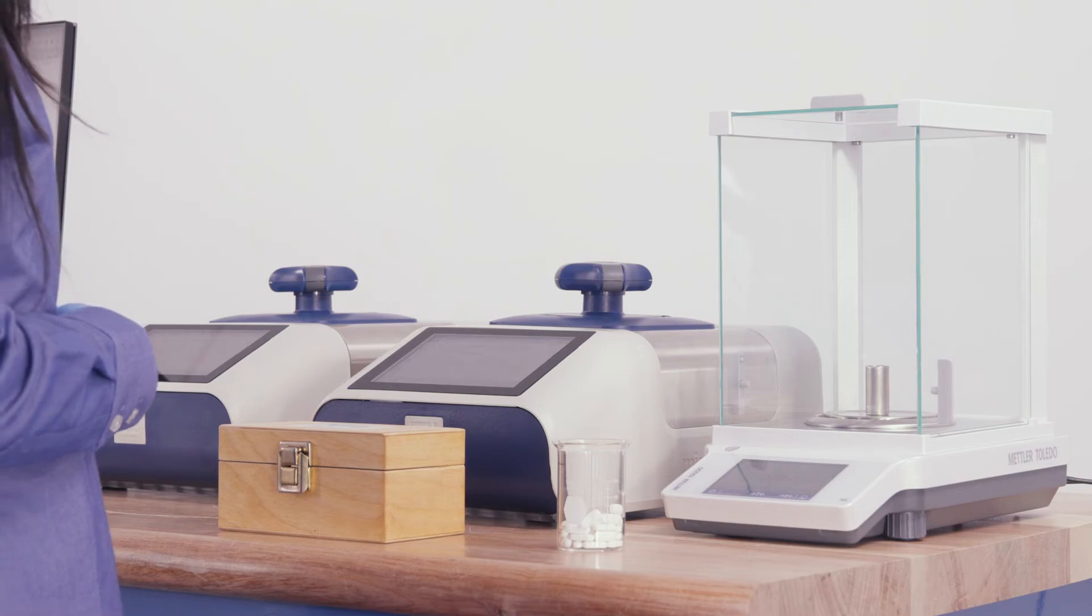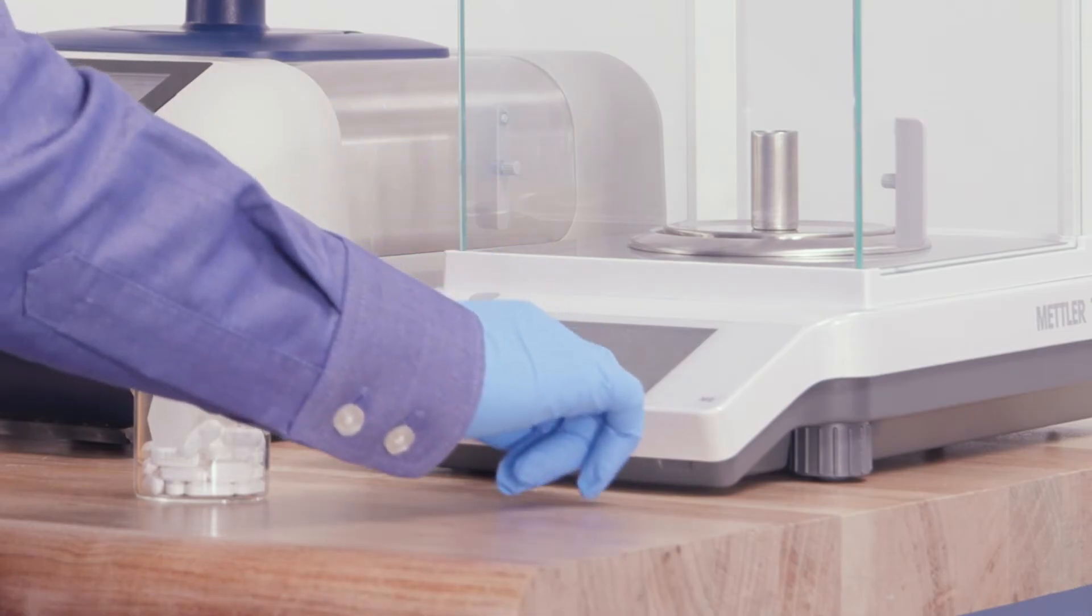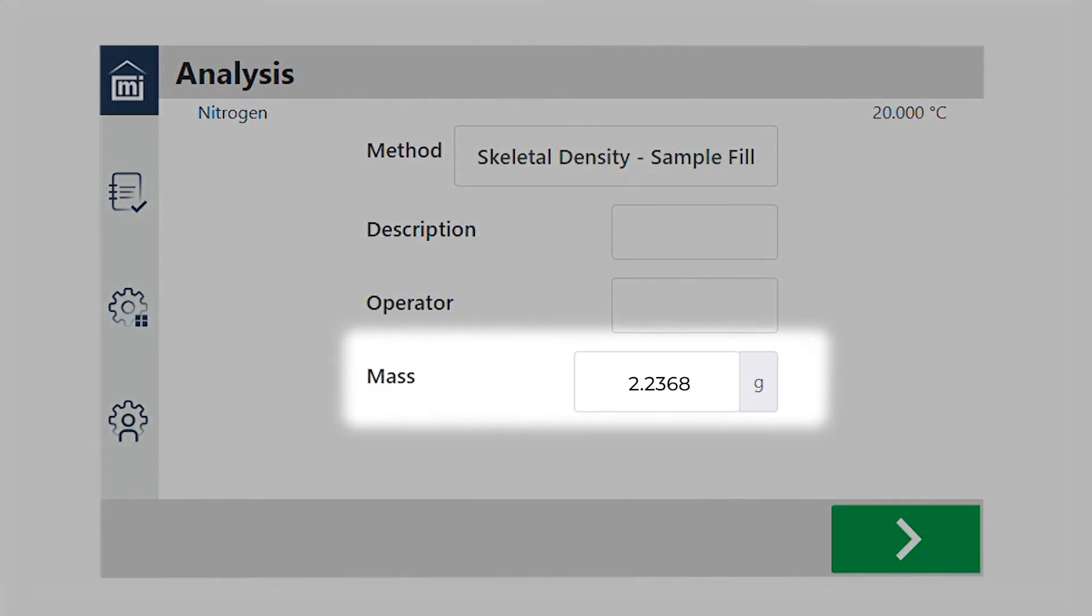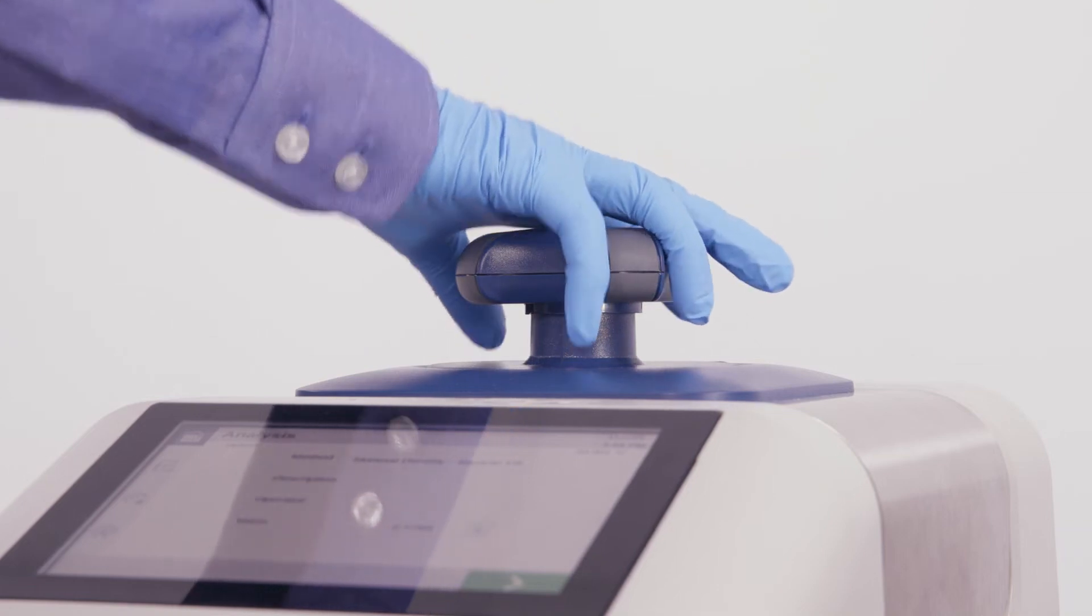The AccuPIC can be connected directly to the balance to make the transferring of mass easy. Just click the transfer button on the balance and the mass is transferred. Now that we have weighed the sample, we can place the cup into the chamber.